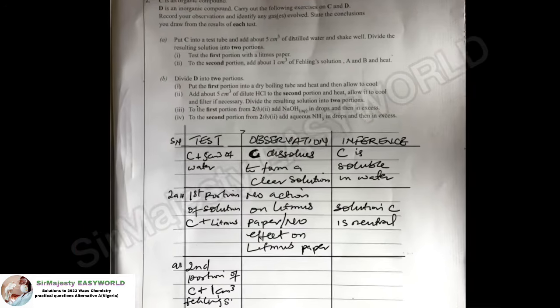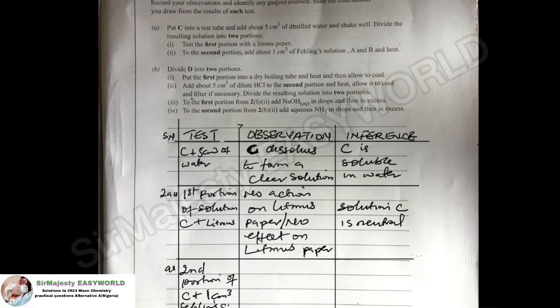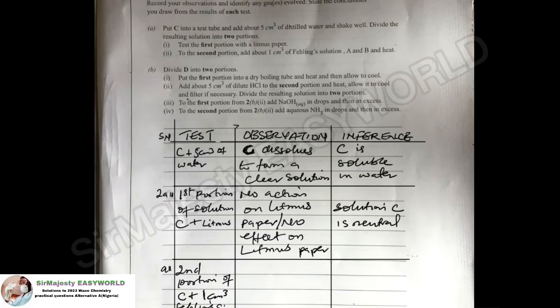Let's go back. Divide the resulting solution into 2, to the first portion from 2bii. So you are going to write first portion from 2bii plus sodium hydroxide. Do you see how to report this now? So you don't need to repeat add.